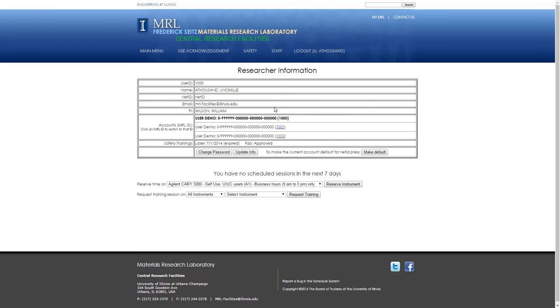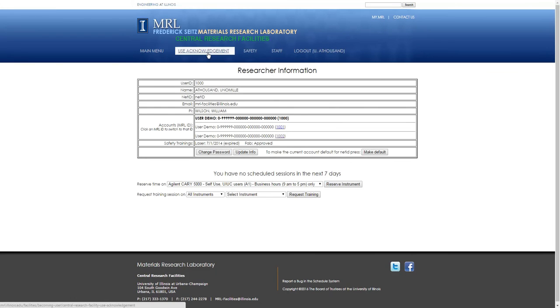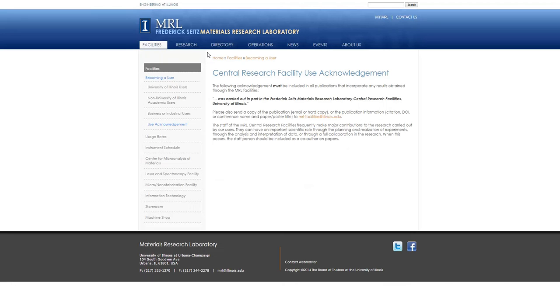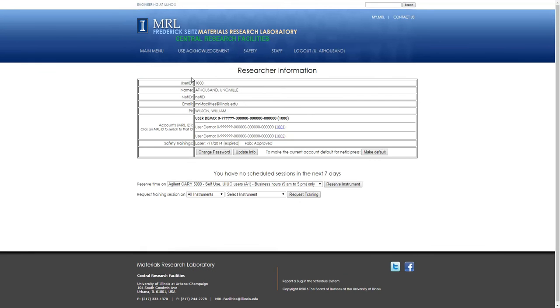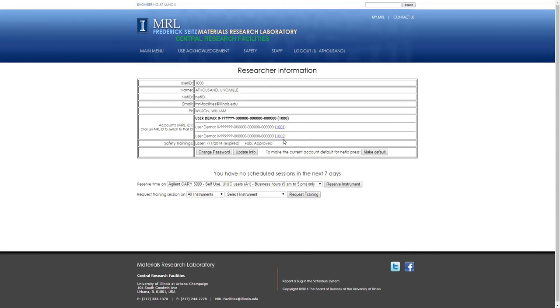This will take you to a page where, again, there's a list of links at the top. The Use Acknowledgement is what you copy and paste into your papers to say that you've done your research here. The information about you is contained in this top part, which will have things like your different user numbers associated with different projects, for example, if you're doing a summer project for a collaborator.